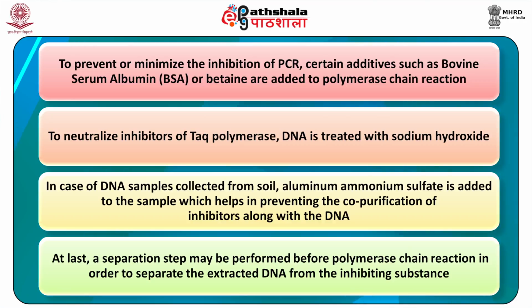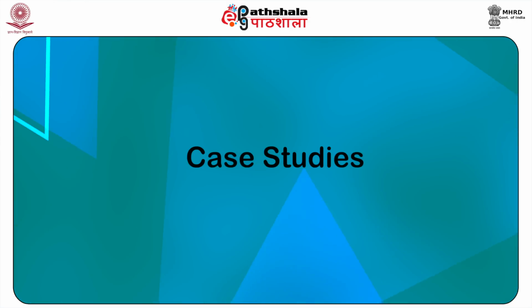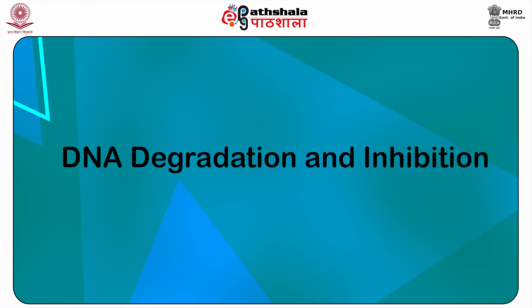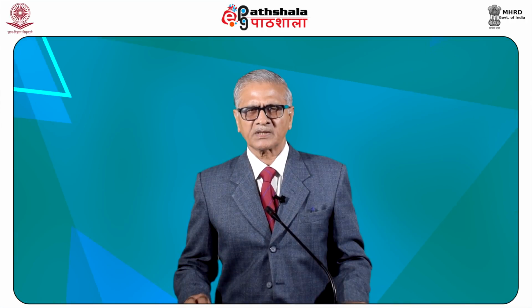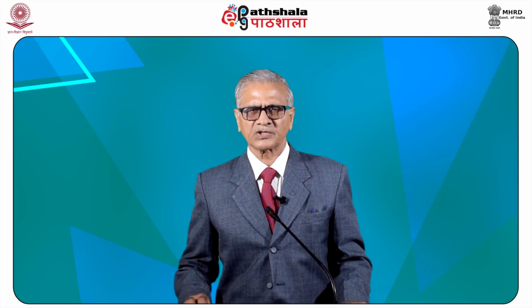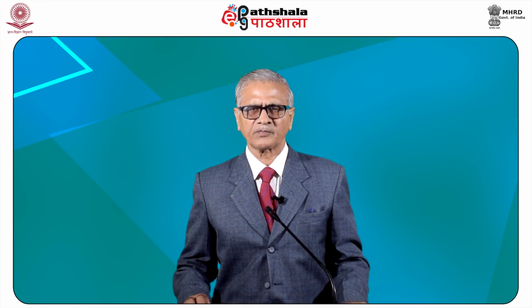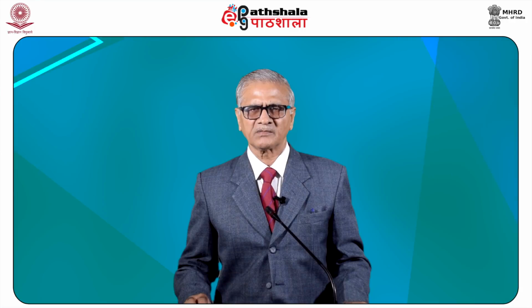At last, a separation step may be performed before the polymerase chain reaction in order to separate the extracted DNA from inhibiting substances. Now, I shall talk about some case studies related to PCR failures. Investigation of the effect of DNA degradation and inhibition on PCR amplification of single source and mixed forensic samples. Studies have been conducted by Bruce McCord and others to assess the effect of DNA degradation and inhibition on PCR amplification of single source and mixed forensic samples, with the goal of examining the mechanism of PCR inhibition and degradation by performing the following experiments.